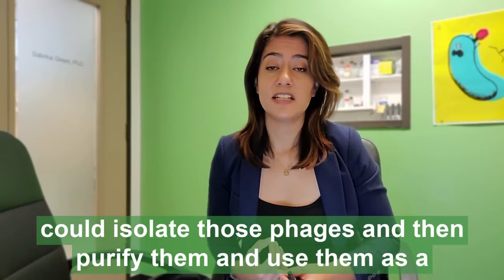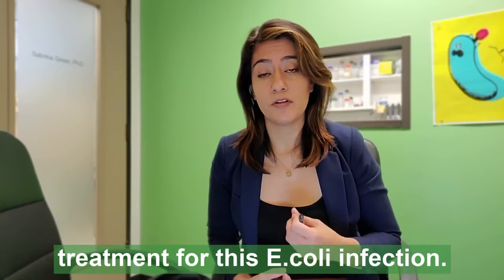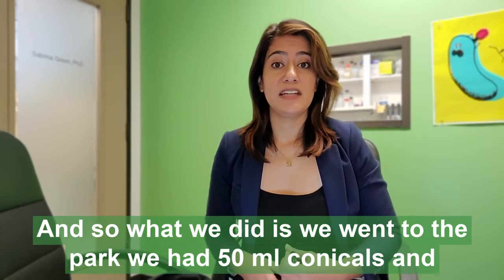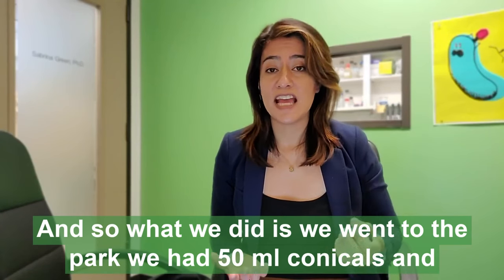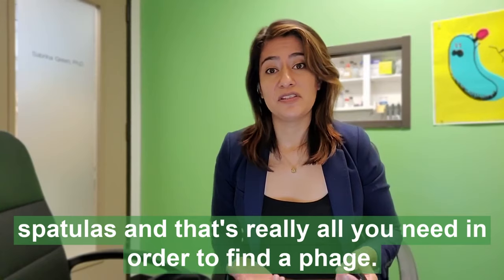We could isolate those phages and then purify them and use them as a treatment for this E. coli infection. So what we did is we went to the park — we had 50 ml conicals and spatulas, and that's really all you need in order to find a phage.